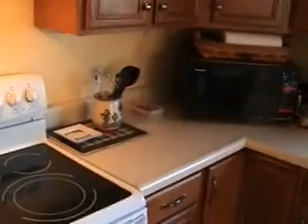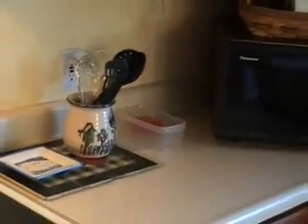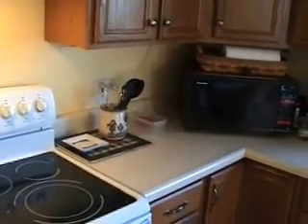Now what I suggest is putting it somewhere by itself where it's not going to get disturbed, maybe on the side area where you can let it sit for 12 hours. In the past we've had problems with people's pets getting it, or little brother and sister. You want to make sure that doesn't happen, because then you'll have to go through the whole setup again.